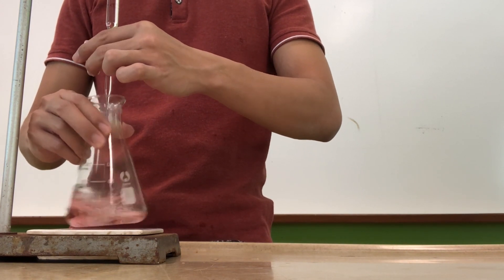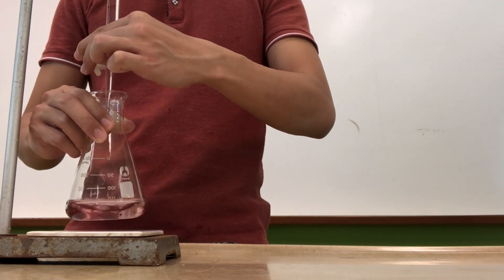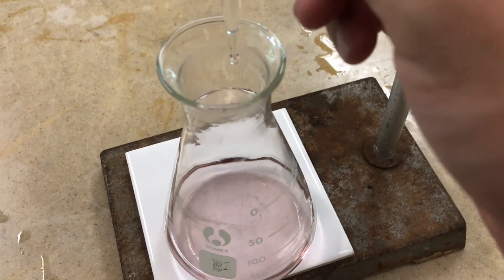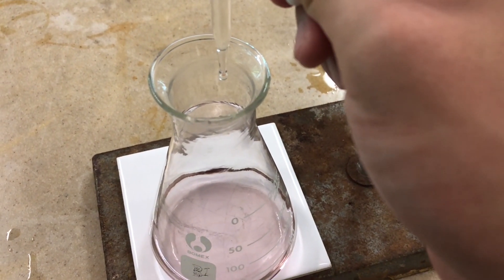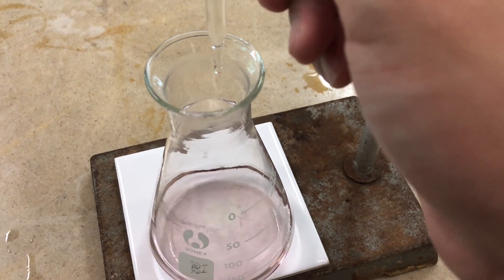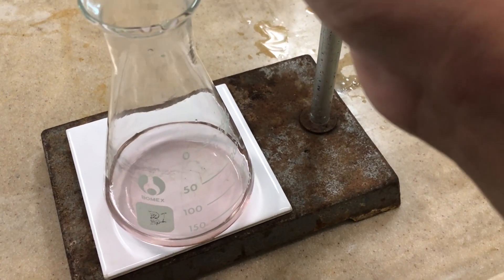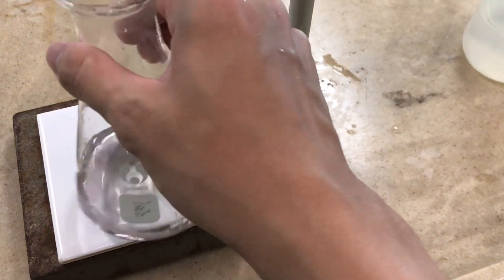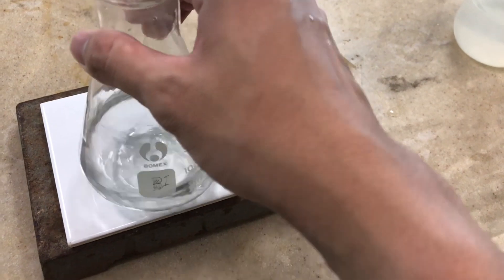Now once you start to see a different color, that's where you need to start slowing down your titration and start to add it in dropwise. Remember the angle that you obtained just now, find it back and try to add in the chemicals slowly at each time. Remember to swirl the chemical to make sure that the indicator and the solutions are mixed well together, so that any form of color change can be observed very obviously. Now it looks like we have achieved the end point, whereby this color change actually gives you a grey solution.